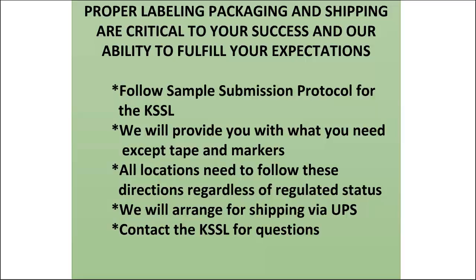As far as shipping the samples in, we've made it a uniform protocol. Whether it's quarantines that we may receive or non-regulated soils, we ship them all the same way. It's required that every sample that comes in be shipped the way that's in the document, and I'm going to show you some pictures of how we pack them. We provide you with everything you need for labeling, packing, and shipping, except that you need some good packaging tape to tape up the boxes and the markers to mark with. We follow these directions regardless of whether it's regulated or quarantined, and we will arrange for the shipping via UPS, so you don't have to worry about it.